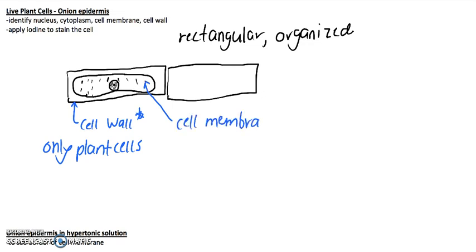In its normal environment, it's hard to distinguish the border of the cell membrane, but there is a way to isolate it, which we'll talk about later. Again, any region inside the cell membrane, this is the cytoplasm. And in this case, it happens to be granular, so we can give it this additional name, a granular cytoplasm. And then lastly, we have a nucleus.